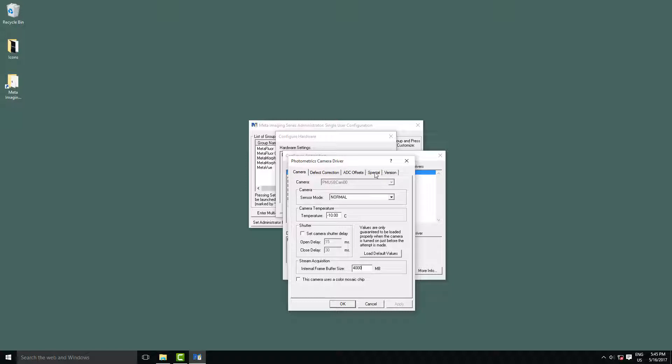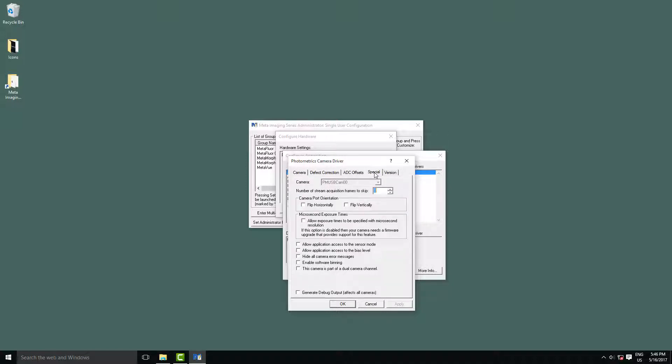Another setting you might occasionally want to change is on the Special tab, and this is if you have mirrors in your optical path, your image might be flipped compared to how it should be. Here is where you can specify to flip your camera vertically or horizontally.